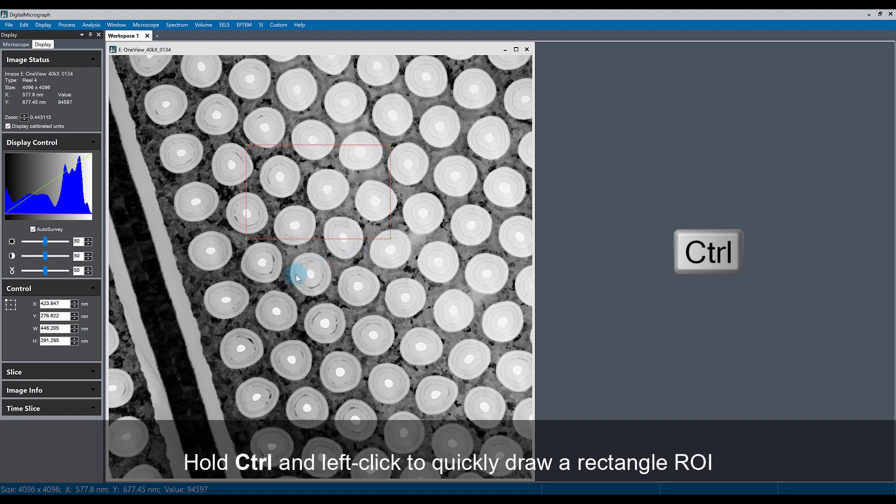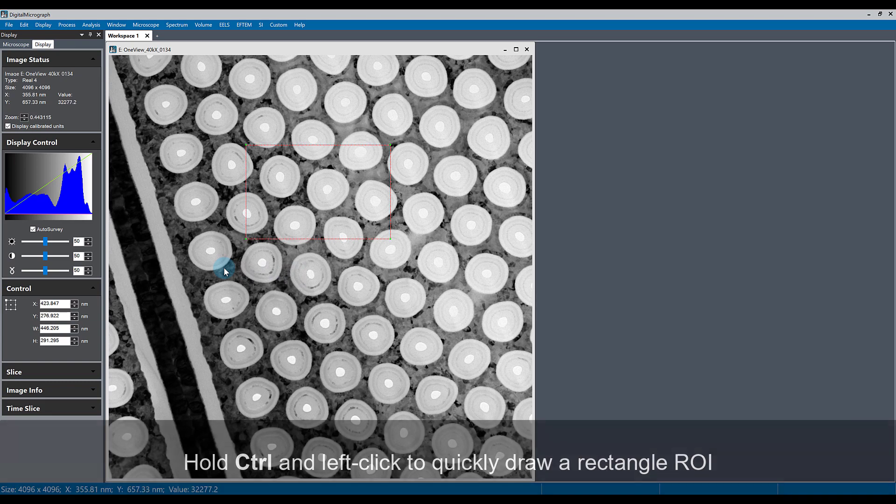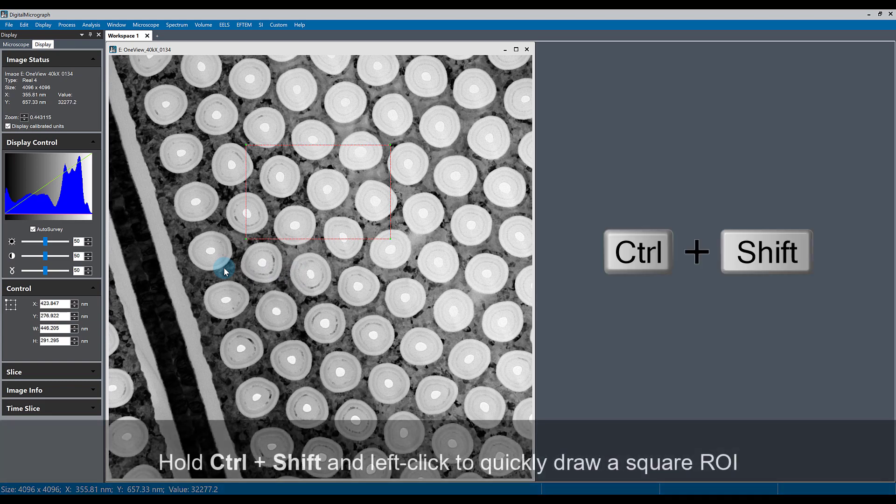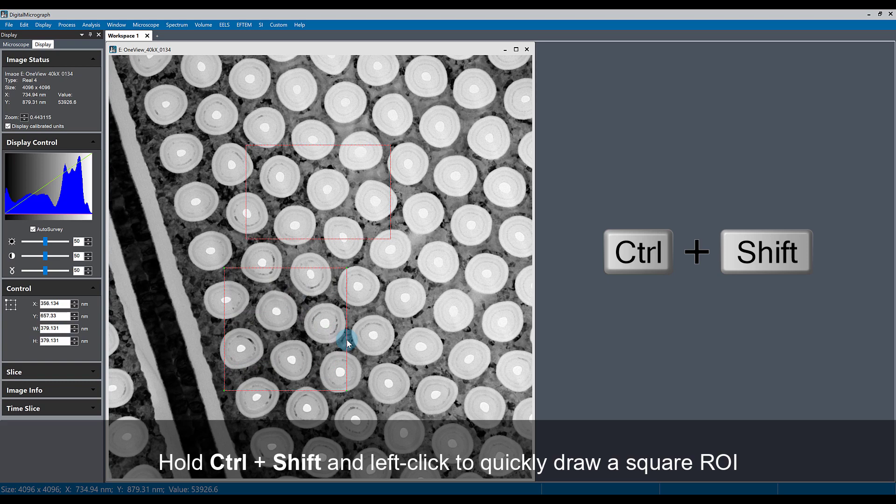If, for example, we want to draw a square ROI very rapidly, we can hold the control key and the shift key while left-clicking and dragging to draw a square ROI.